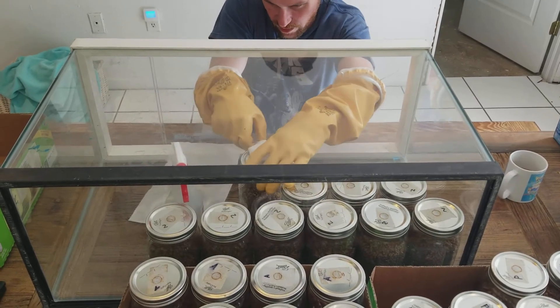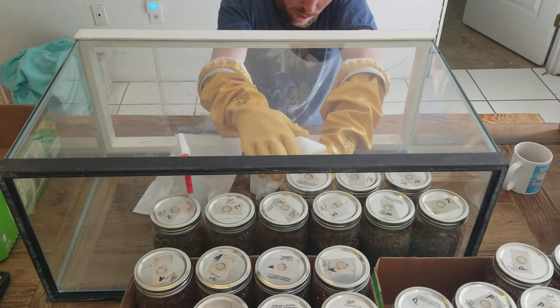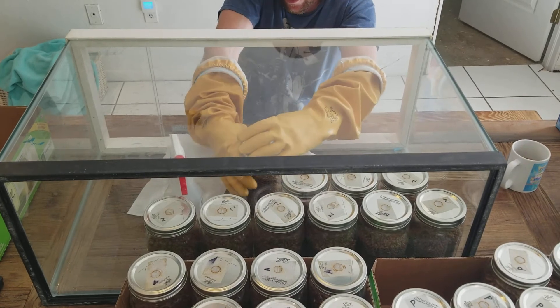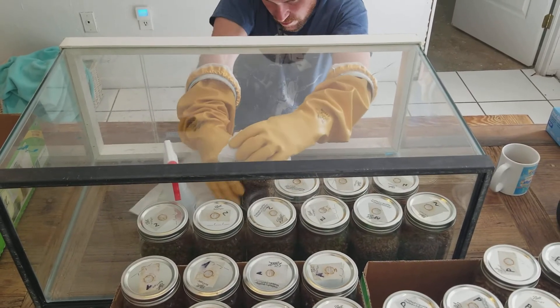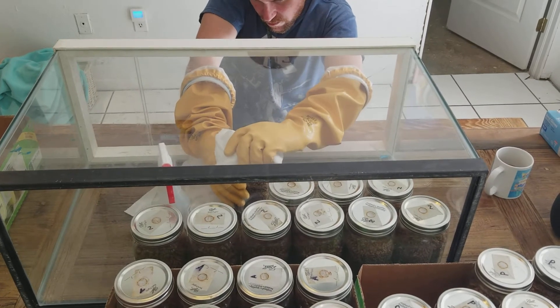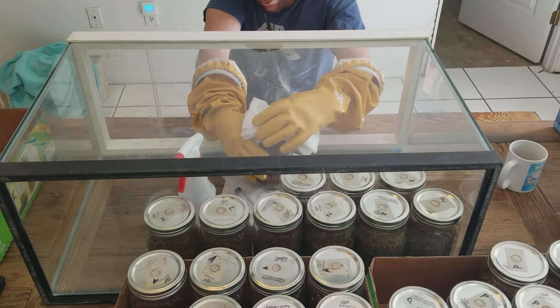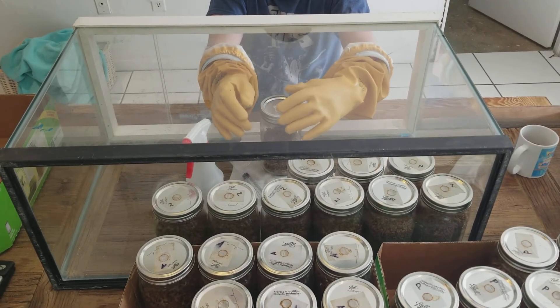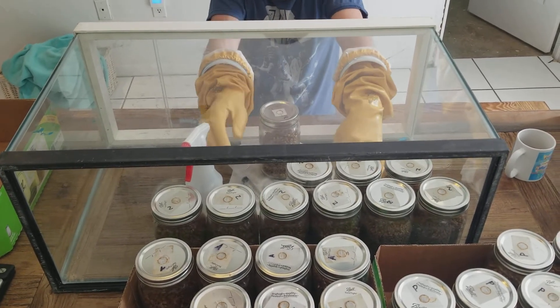I'm going to wipe the lids off. I'll just spray a little bit of isopropyl alcohol on them and wipe them off real good. Then I'm going to loosen the band. I like to use this paper towel here to hold the jar to keep it from moving around too much. So I'm just going to loosen the band real quick and set it off to the other side for the moment.